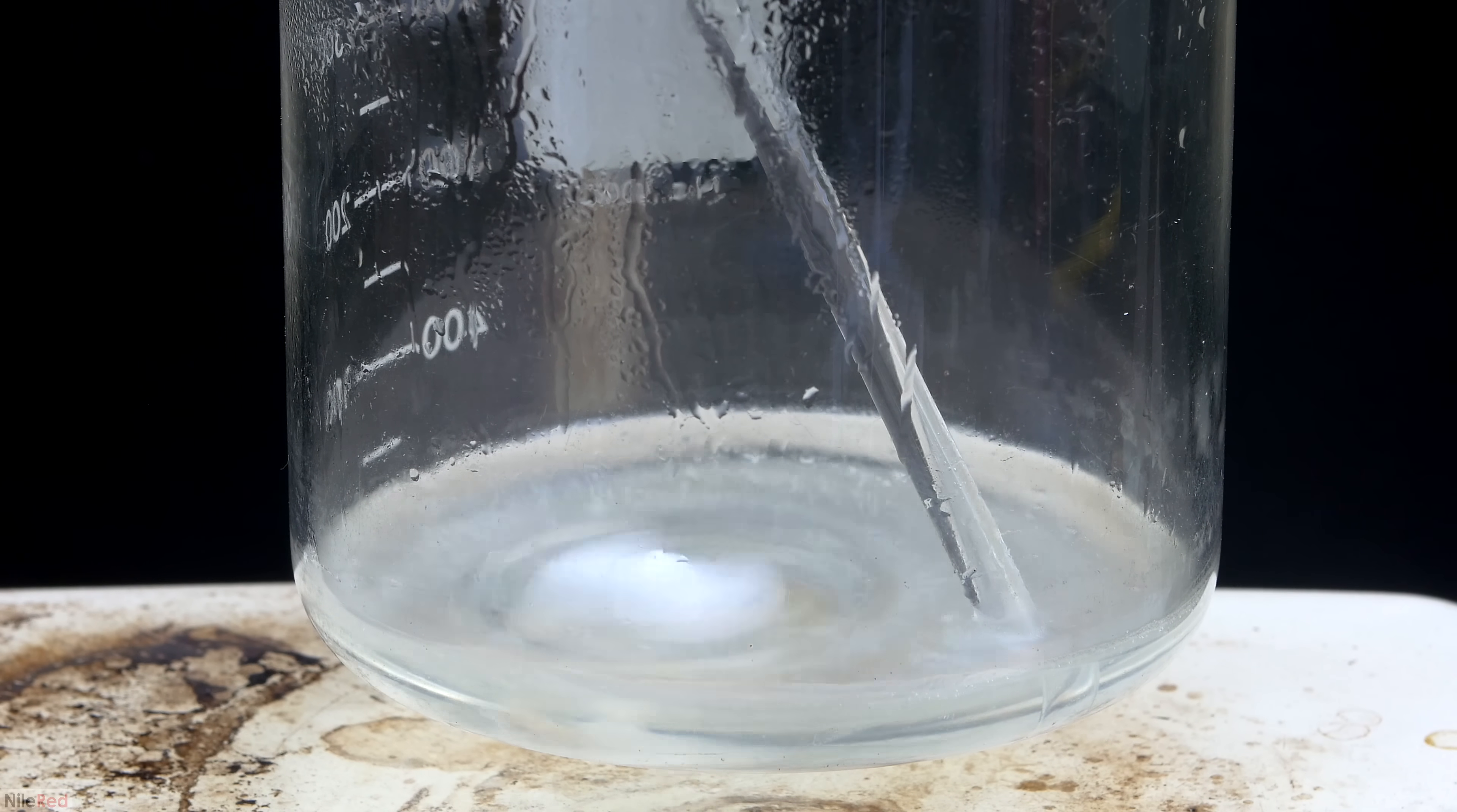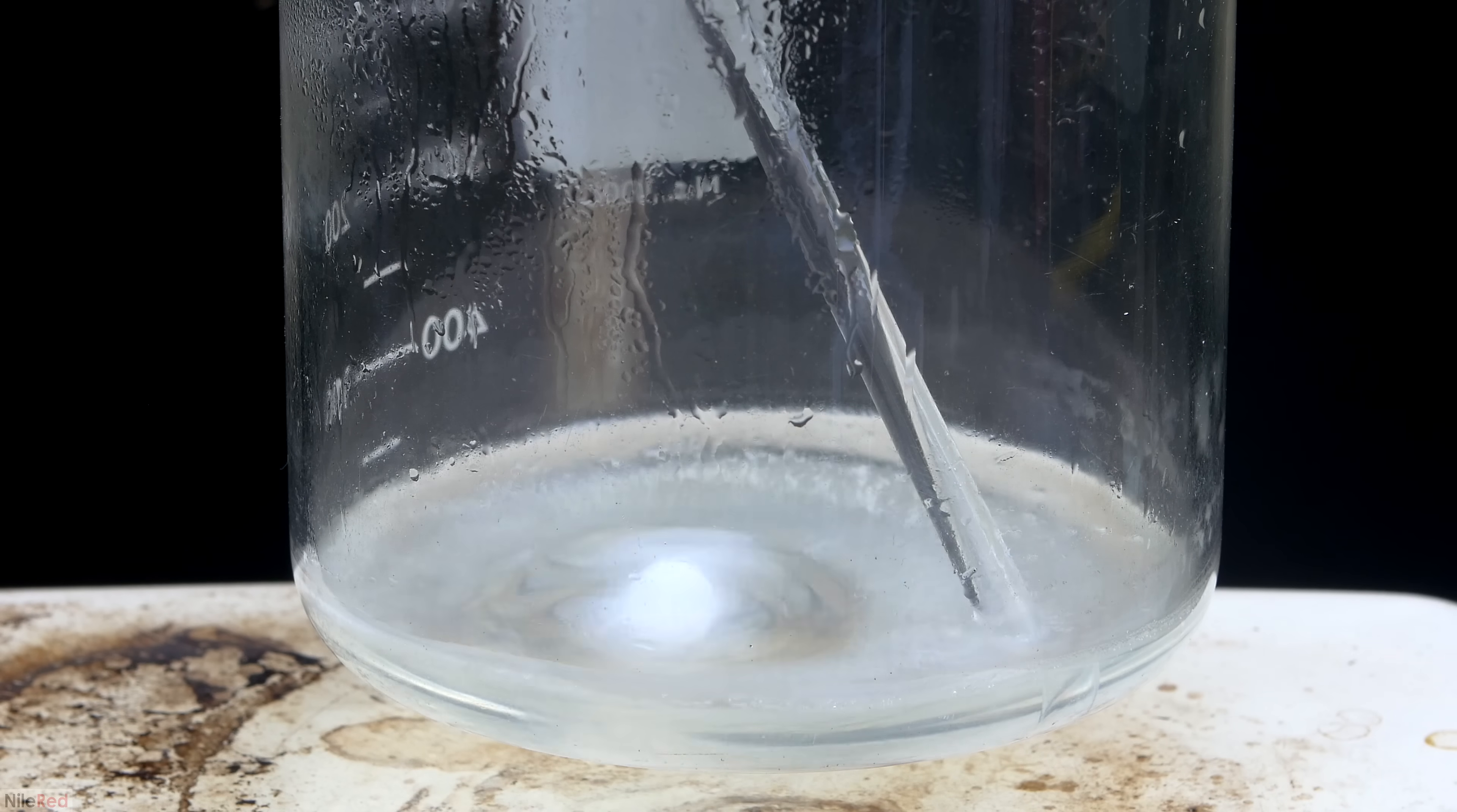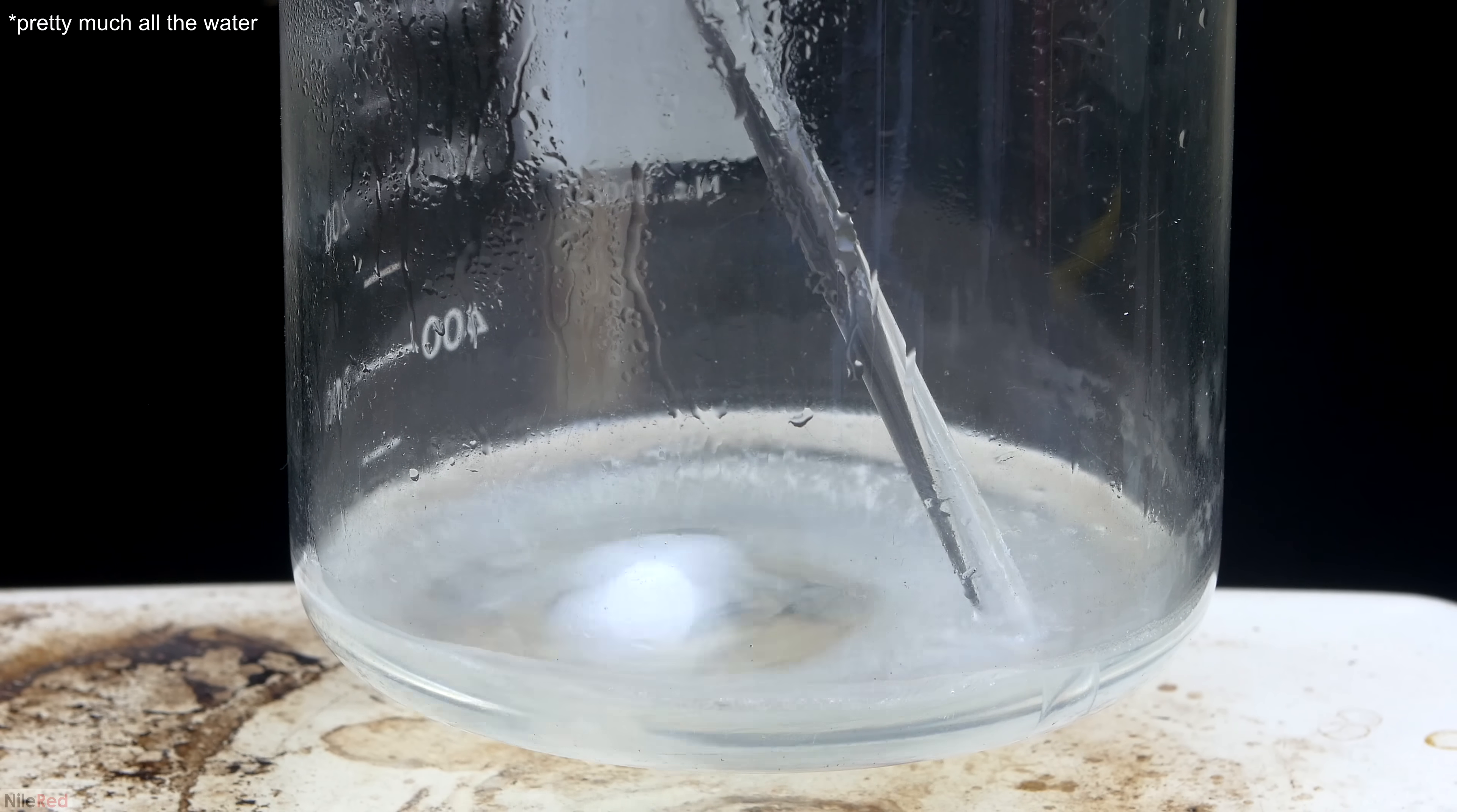Mercury(II) nitrate has an anhydrous form and a hydrated form, and the melting point of the hydrated form is 79 degrees Celsius. Even when all of the water is gone, we'll still have a liquid, because we have to slowly decompose our hydrated mercury nitrate into its anhydrous form.